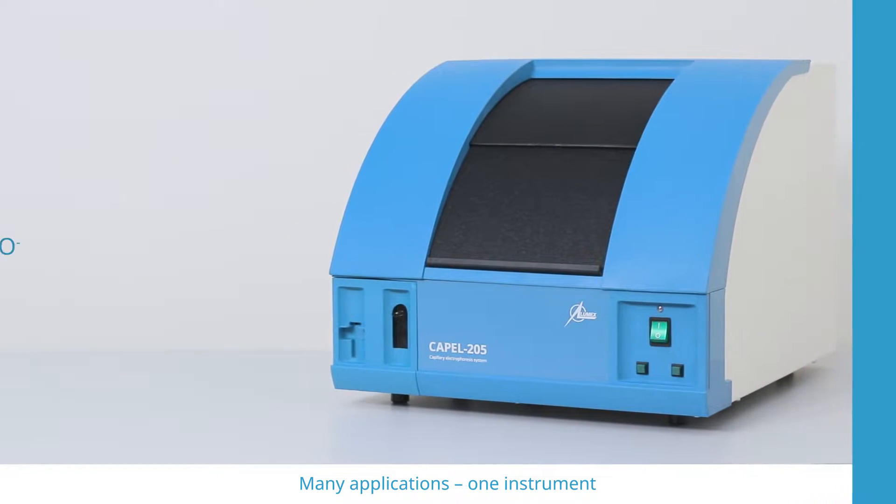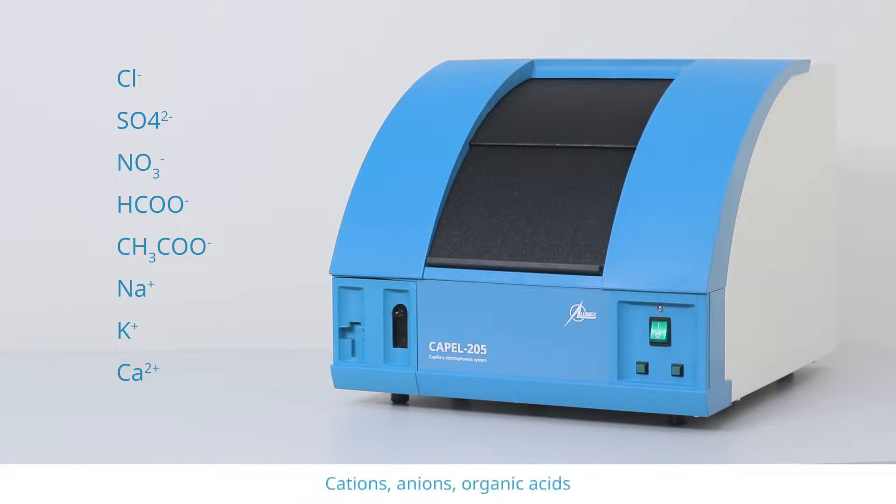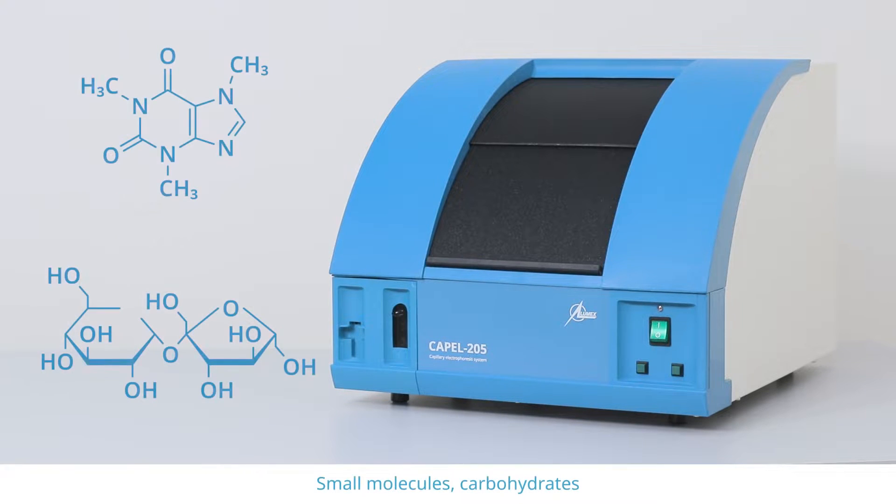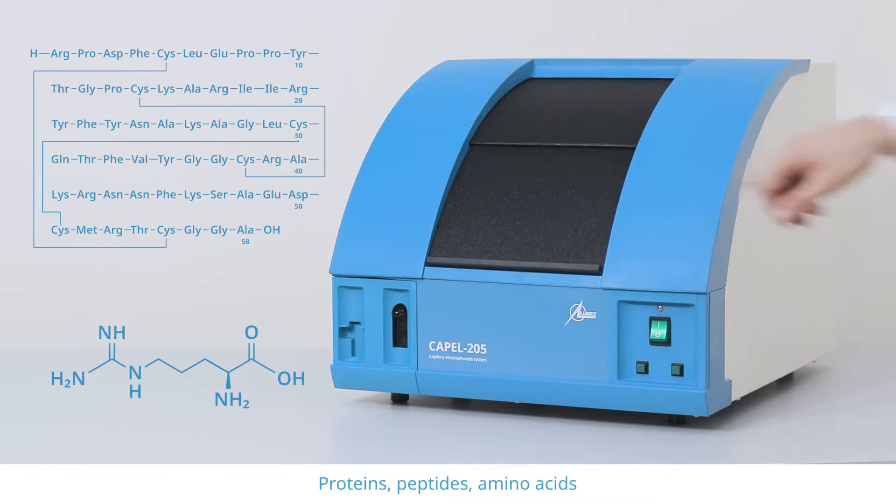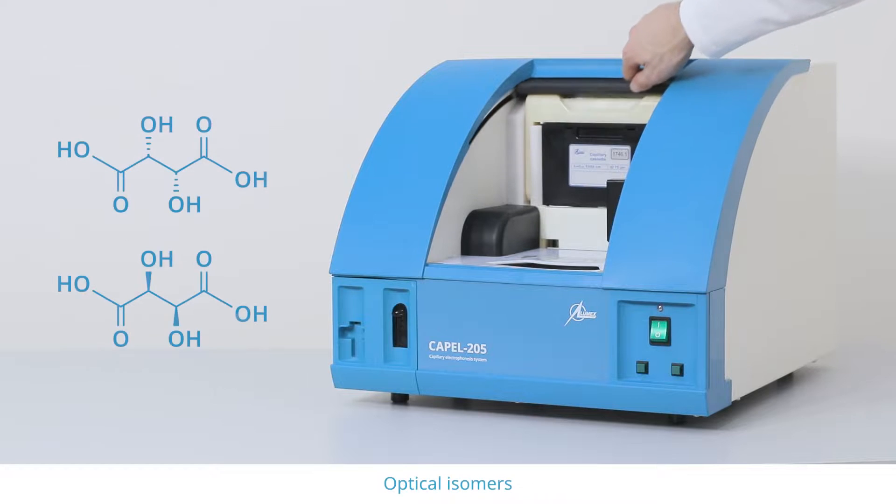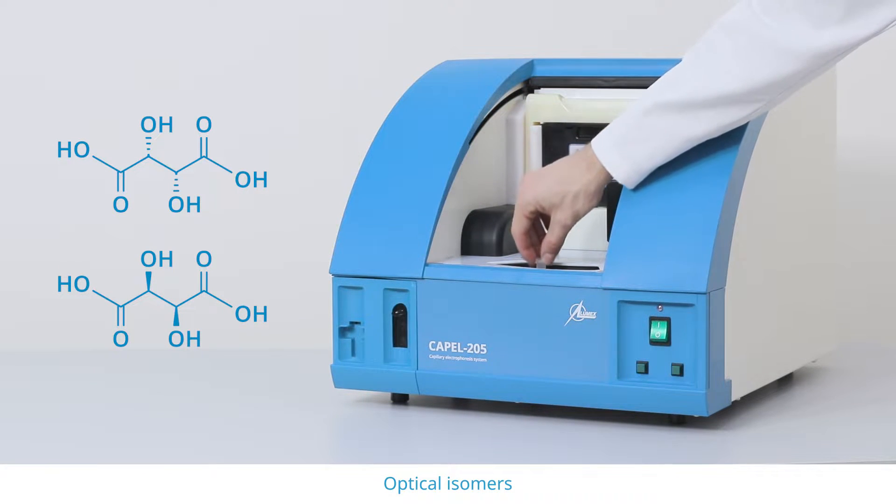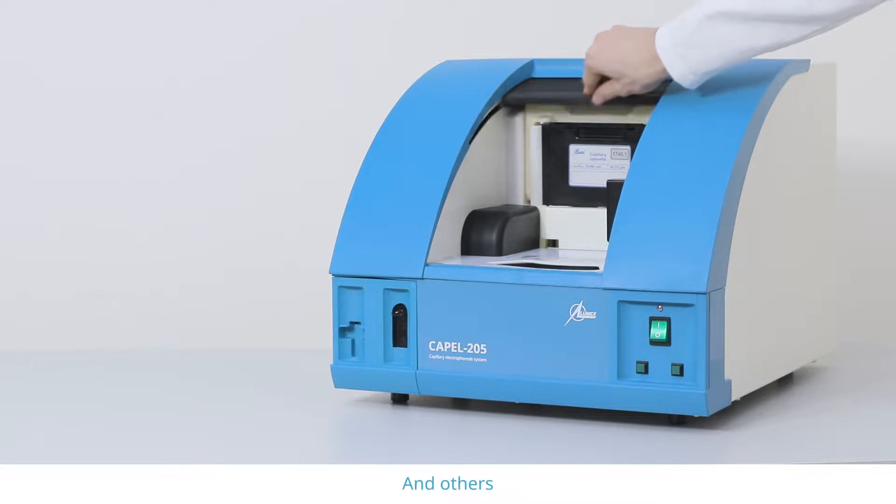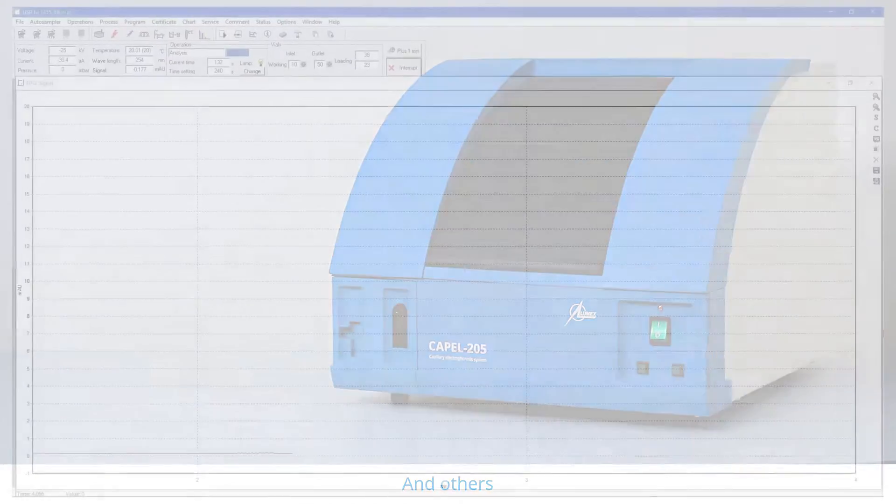CAPEL 205 can detect all classes of analytes: organic and inorganic, ionic and non-ionic, polymers and monomers, optical, cis, trans, and constitutional isomers, and others. All of this is done with one instrument.